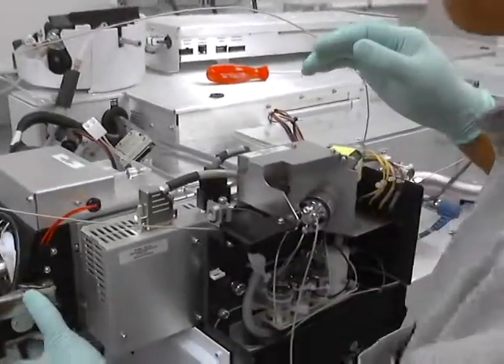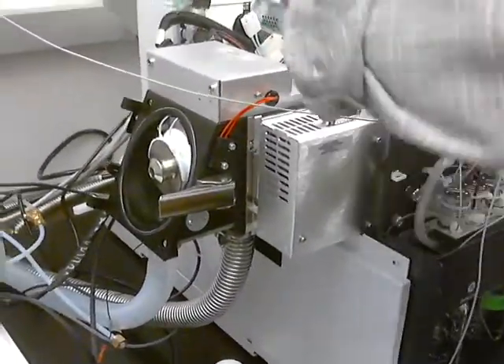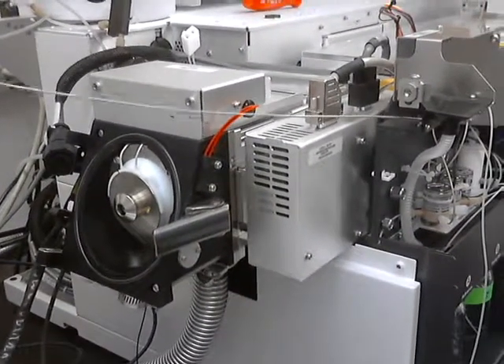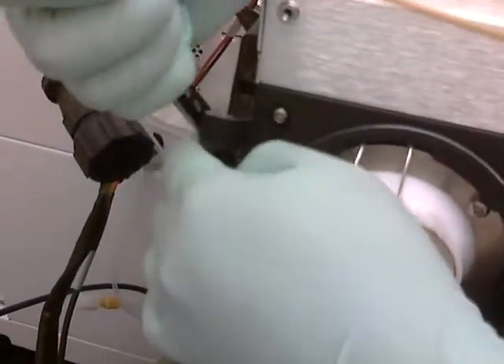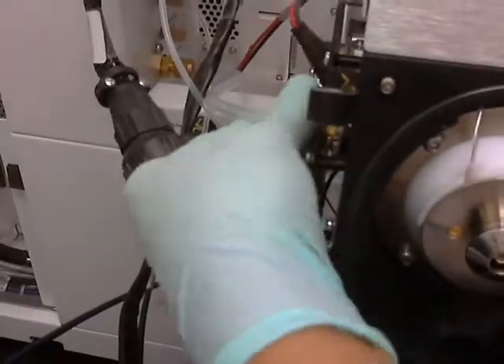Now there's a desolvation chamber right here, and then there's the ion tunnel. Let's take off the desolvation chamber first. We have this big tubing here and this heater connector. Take this nitrogen off — nine-sixteenths wrench. So that comes off.